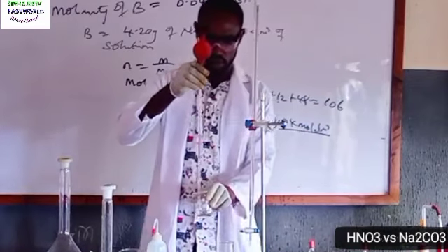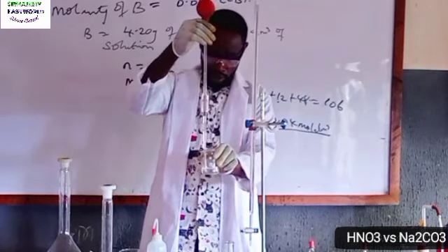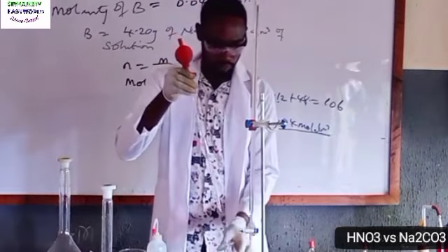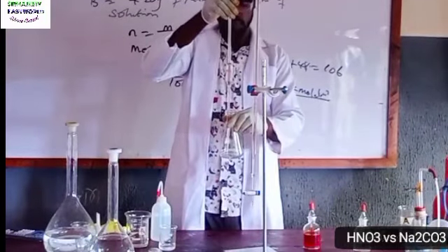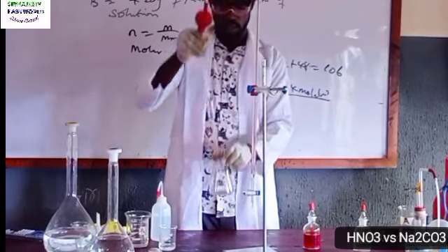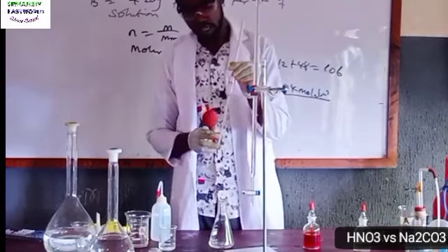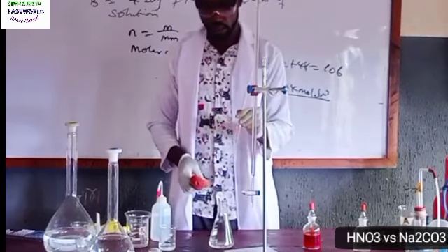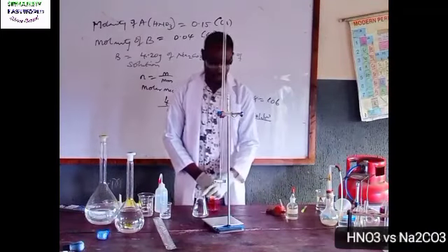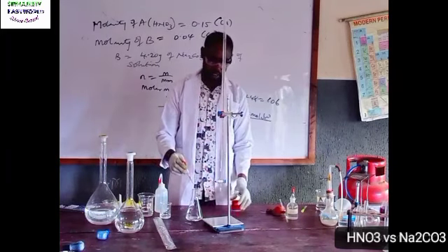Gently press this together. That's great. Remember not to blow off what is remaining, no problem about that, it is insignificant. So next is to add, this is my 25 ml of B, adding my indicator.